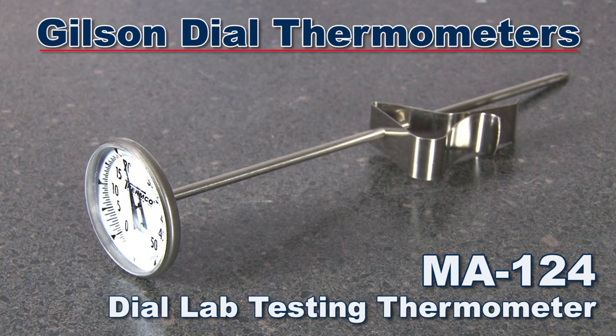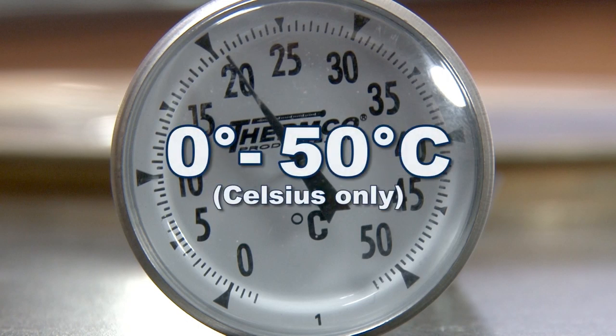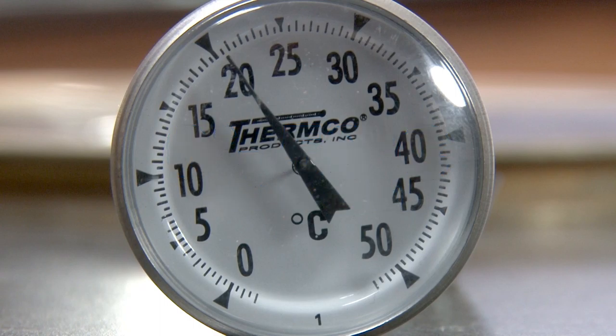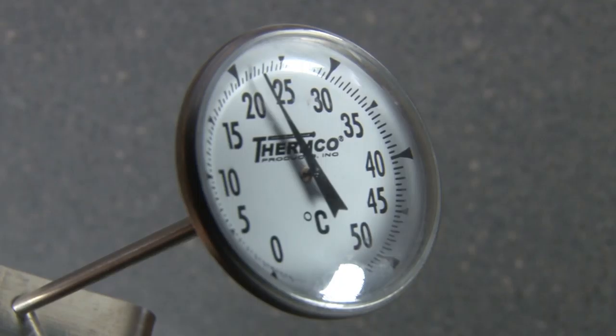The Gilson MA124 dial thermometer has a temperature range from 0 degrees to 50 degrees Celsius with 0.5 degree divisions and a stem of 8 inches in length. The MA124 dial thermometer is accurate to within 1%.